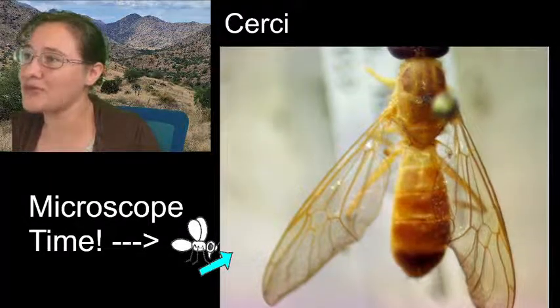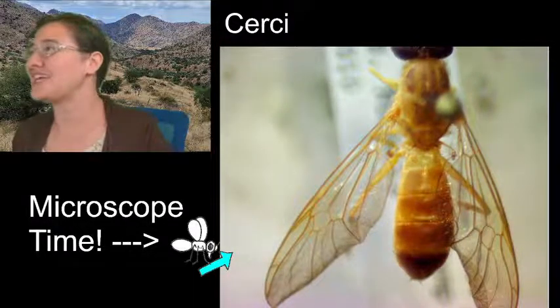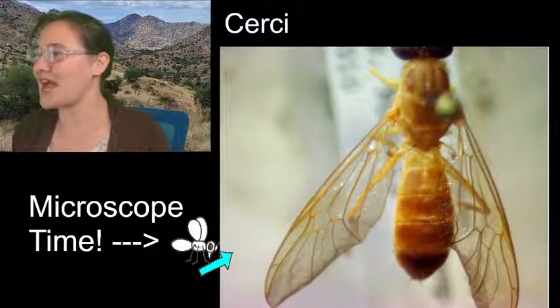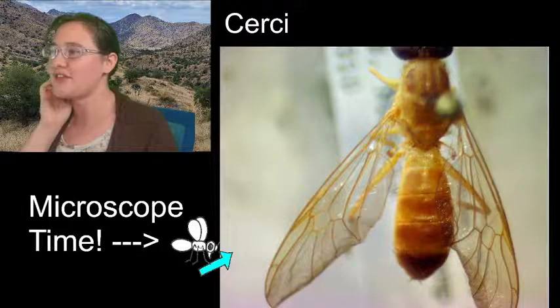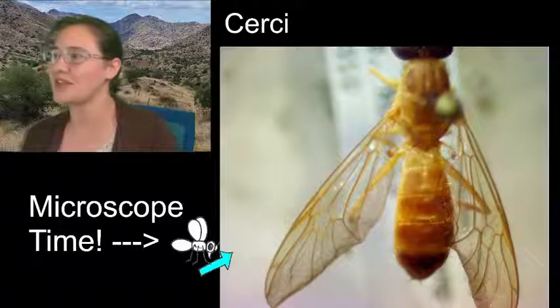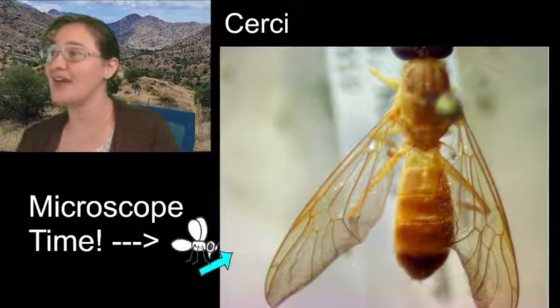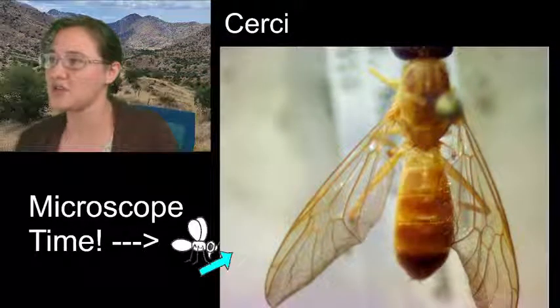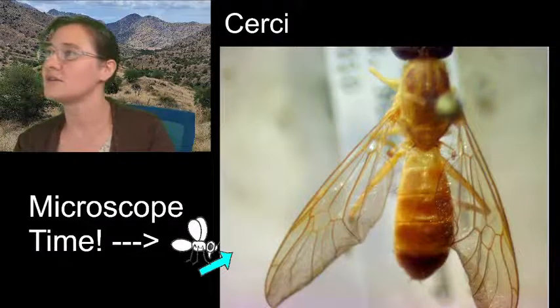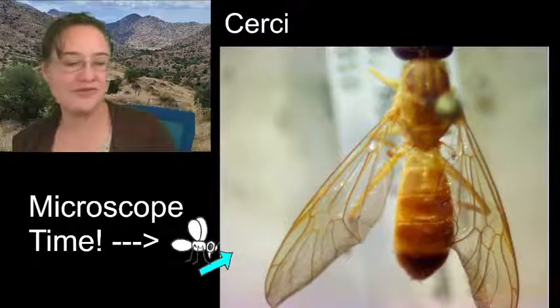Now, there is a really great stratiomyid wing venation chart, and actually it is on Wikipedia. Wikipedia is free. I'm going to go ahead and leave that link in the chat box. If you scroll down just a little bit into the characteristics, there's a whole wing venation chart, and you can follow that along as we are sketching. That's going to be pretty close to what we see here, if you would like.